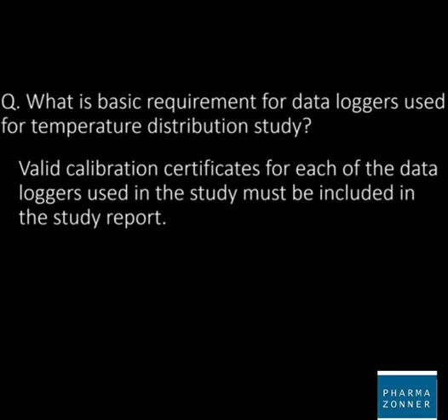What is the basic requirement for data loggers used for temperature distribution study? The very basic requirement for data loggers is the availability of calibration certificates. These valid calibration certificates for each of the data loggers should be available and shall be attached with the study report.